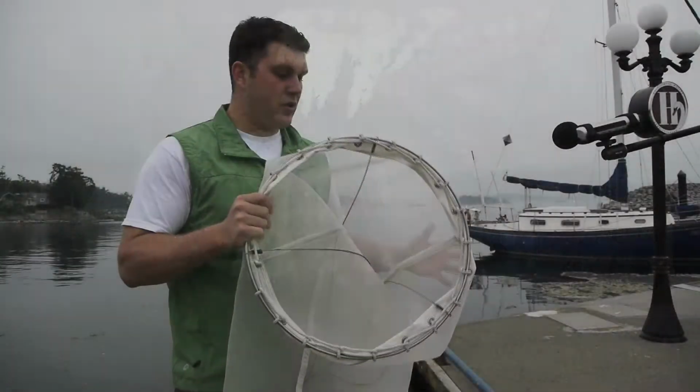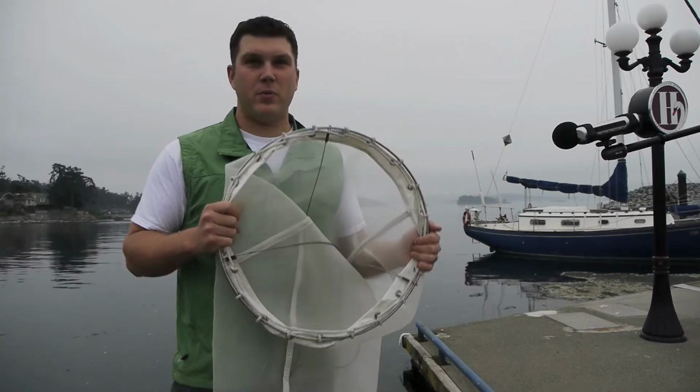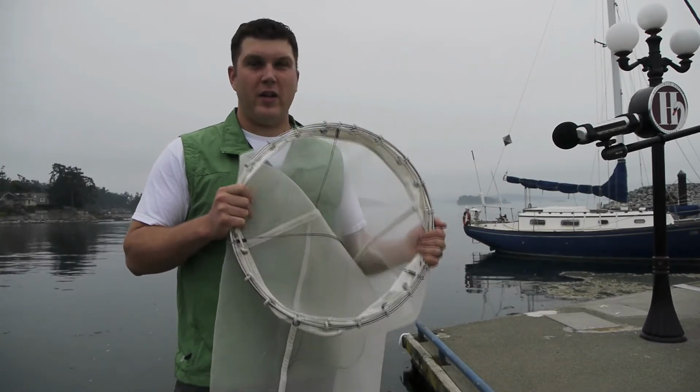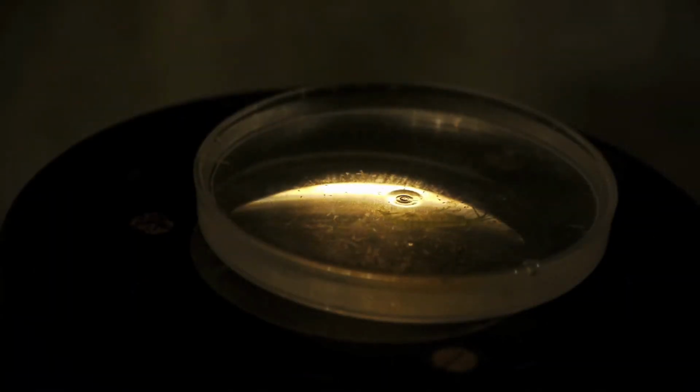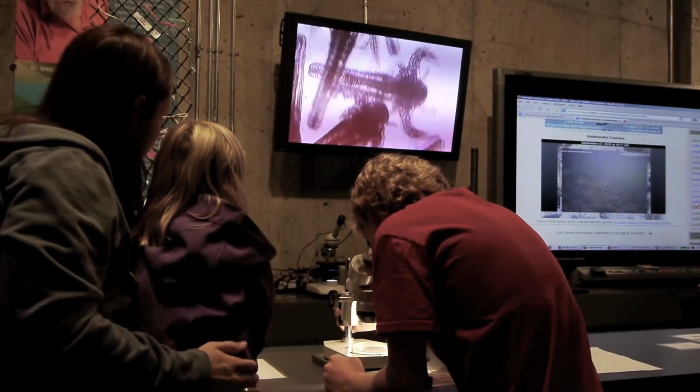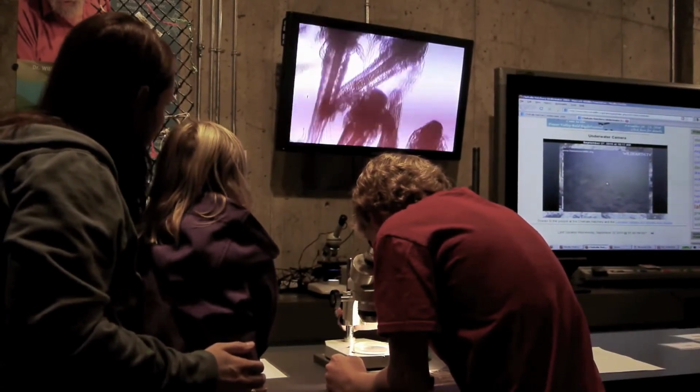It allows us to bring the ocean into the classroom, so we go out and take the kids out and do a plankton tow, and then they get to come back to the center and look at what they've caught underneath the microscopes and underneath the dark field illuminator.